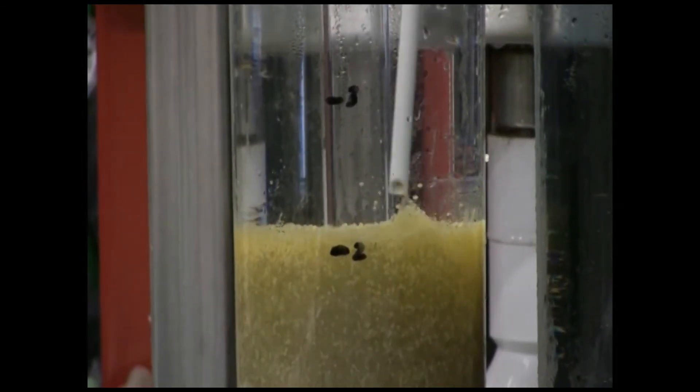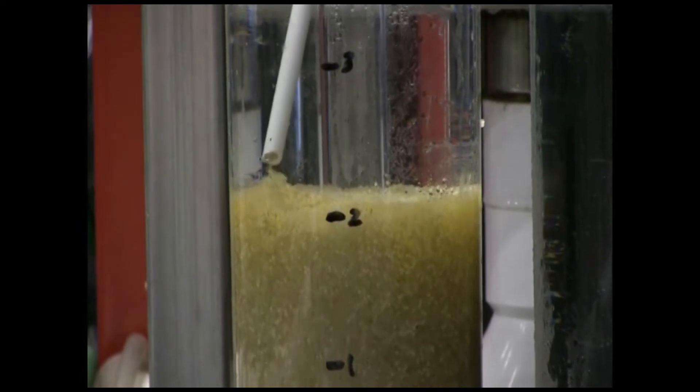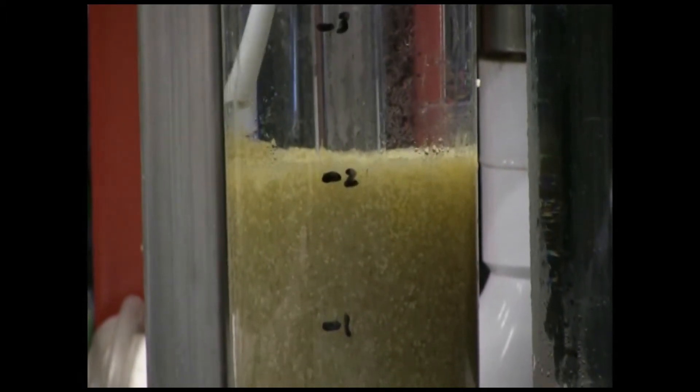The siphon tip should be kept a few centimeters above the layer of dead eggs. When the siphon is running, it will quickly lift the eggs into the tube.